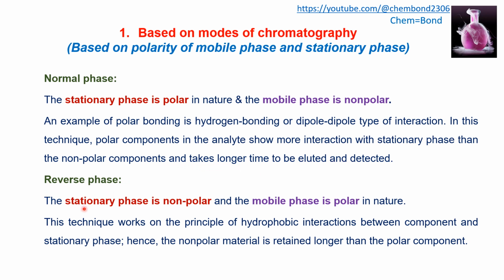In reverse phase, the stationary phase is non-polar and the mobile phase is polar. The principle of separation is hydrophobic interaction between the component and the stationary phase. Hence, the non-polar material is retained longer than the polar components.